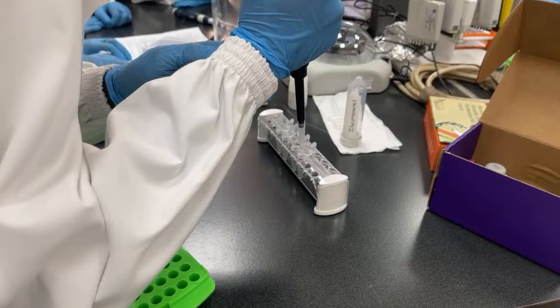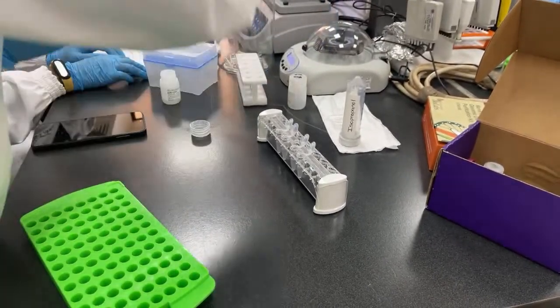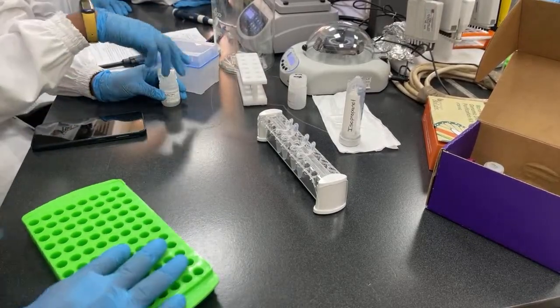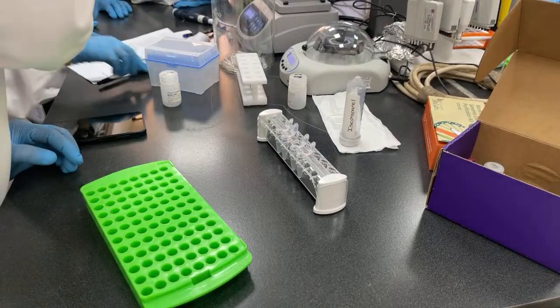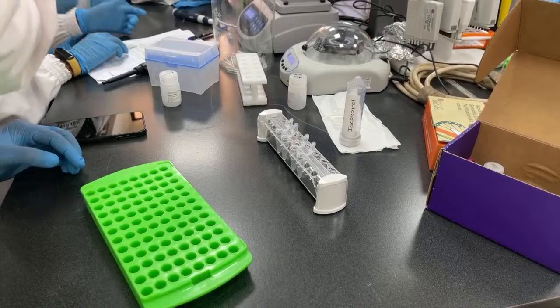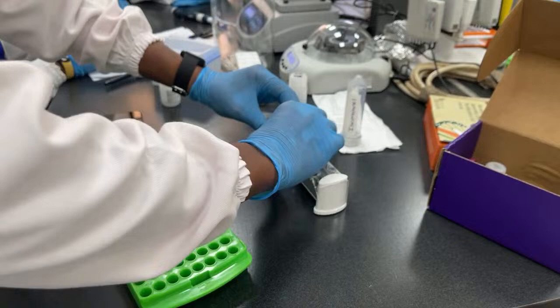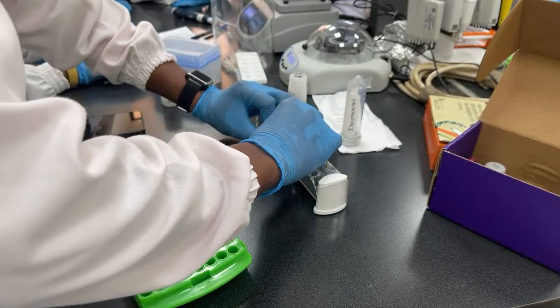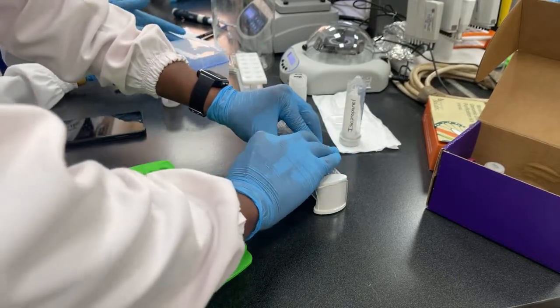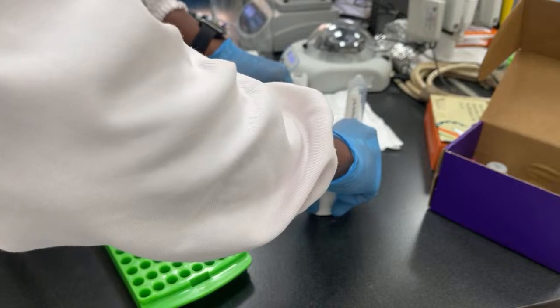Yeah, after you put it back again. So close. Let me see. Remove it on the rack and then invert it, and then you put it back on the rack. You can close first. Yeah. Then bring it back again.